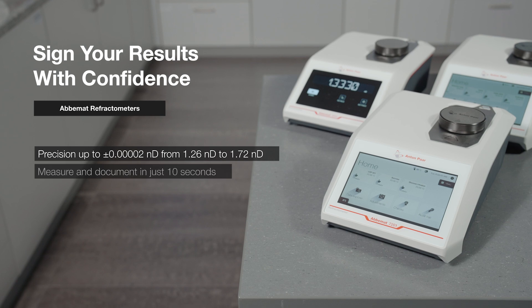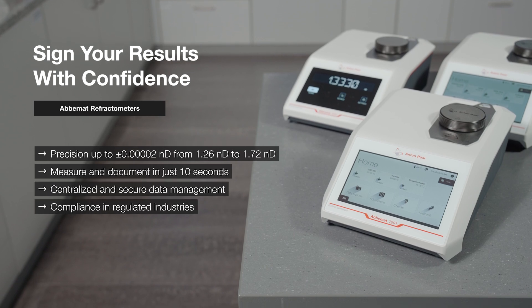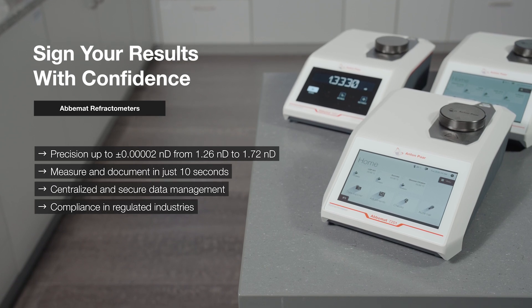Whichever one of the Abiumat refractometers you choose, you'll be choosing to sign your results with confidence.